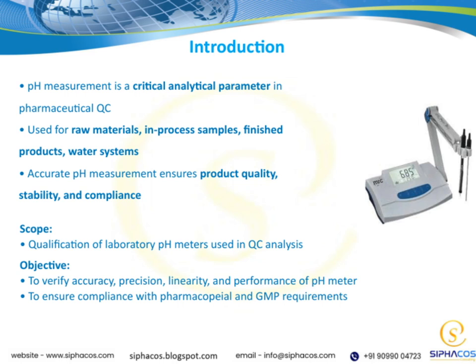If our pH measurements are off, it could lead to incorrect conclusions about the quality or stability of our products. So, maintaining rigorous qualification processes helps us ensure that every measurement we take contributes to producing safe, effective medicines.